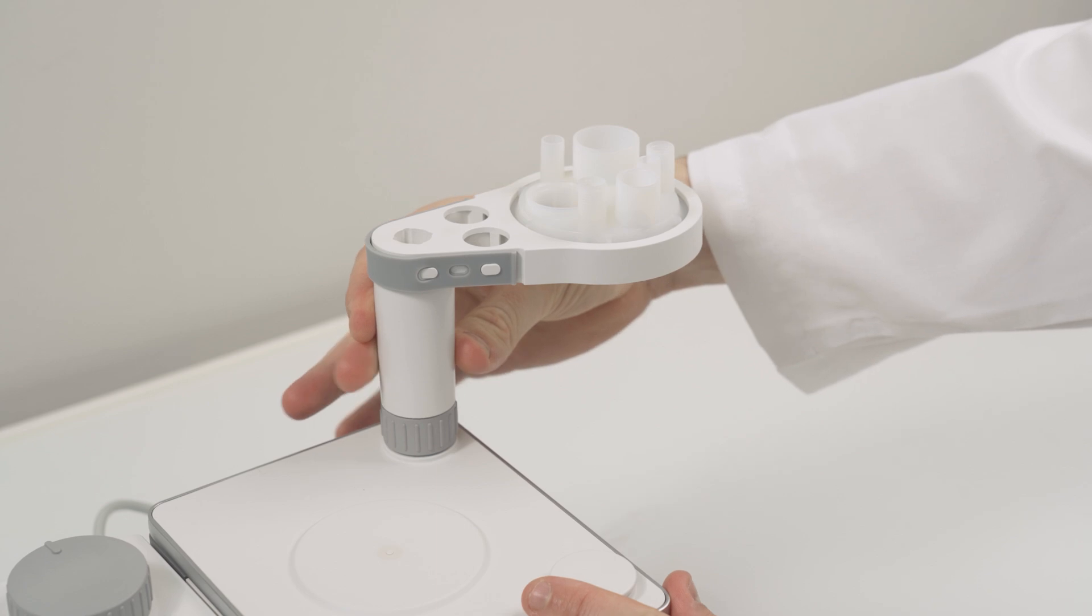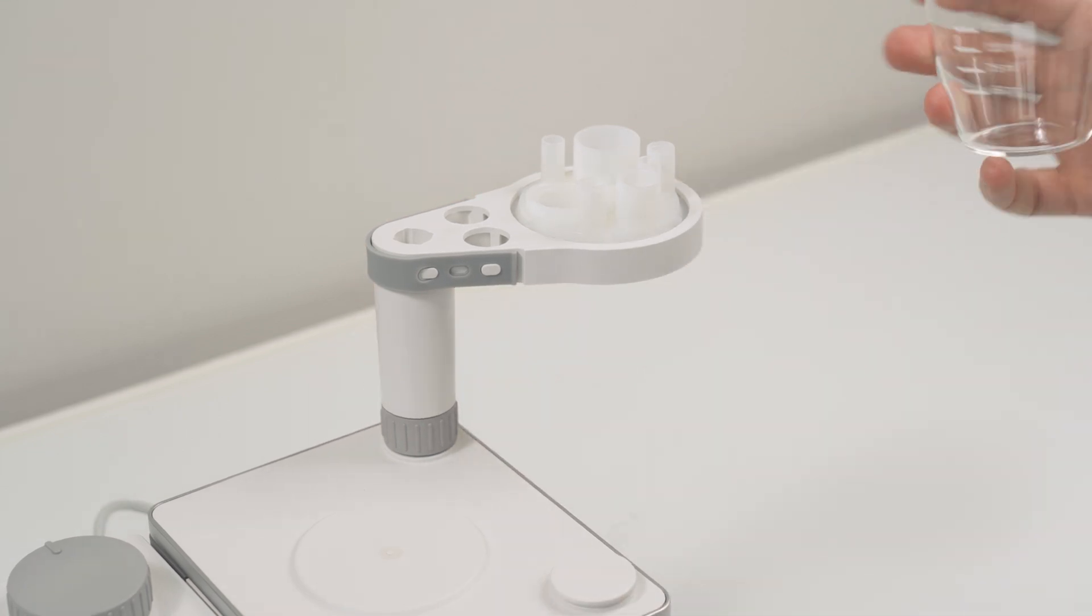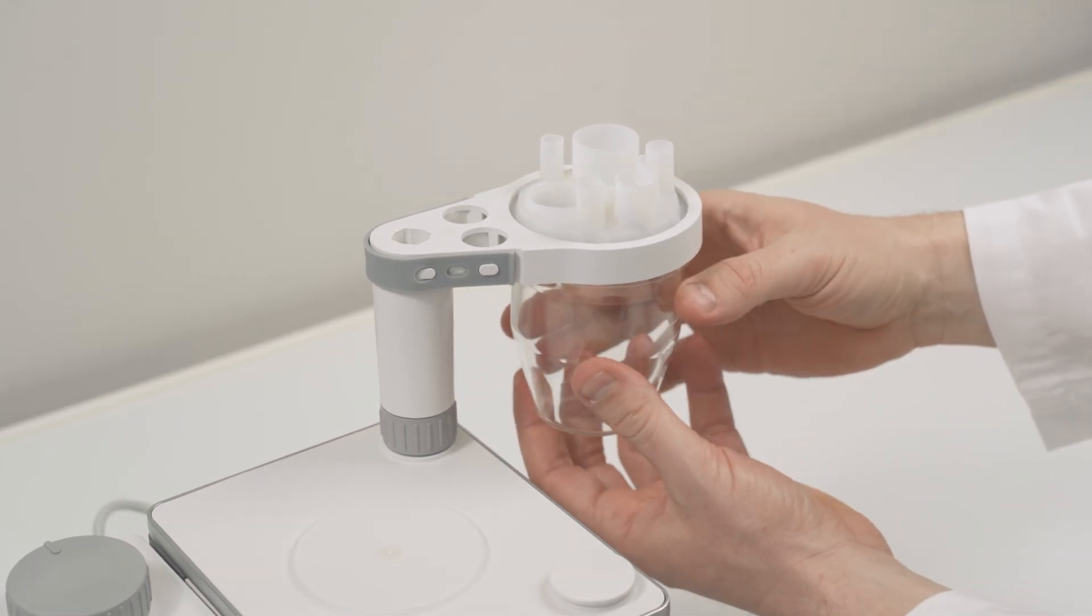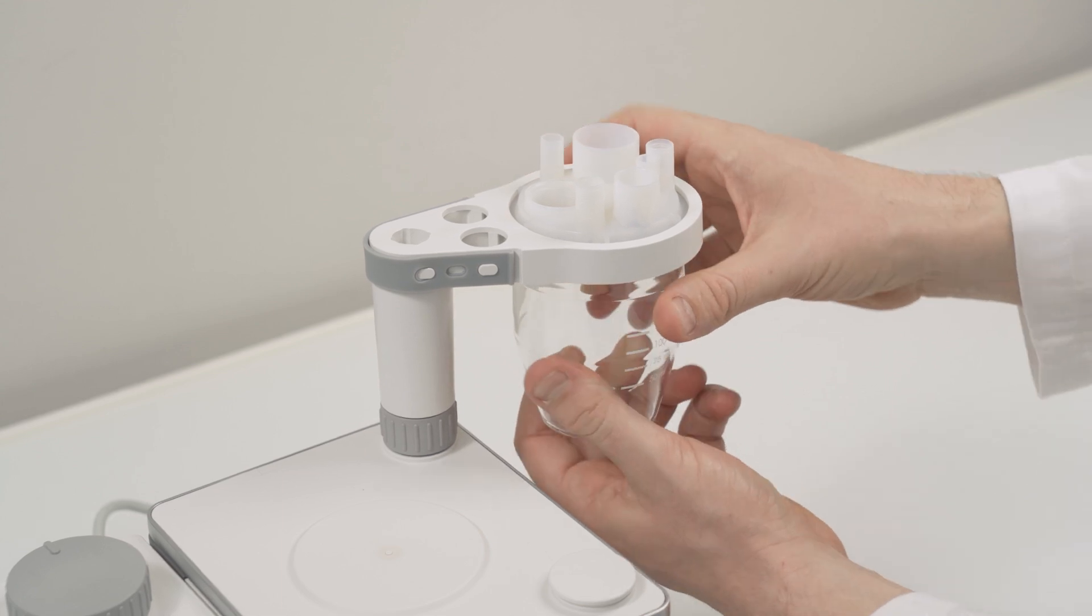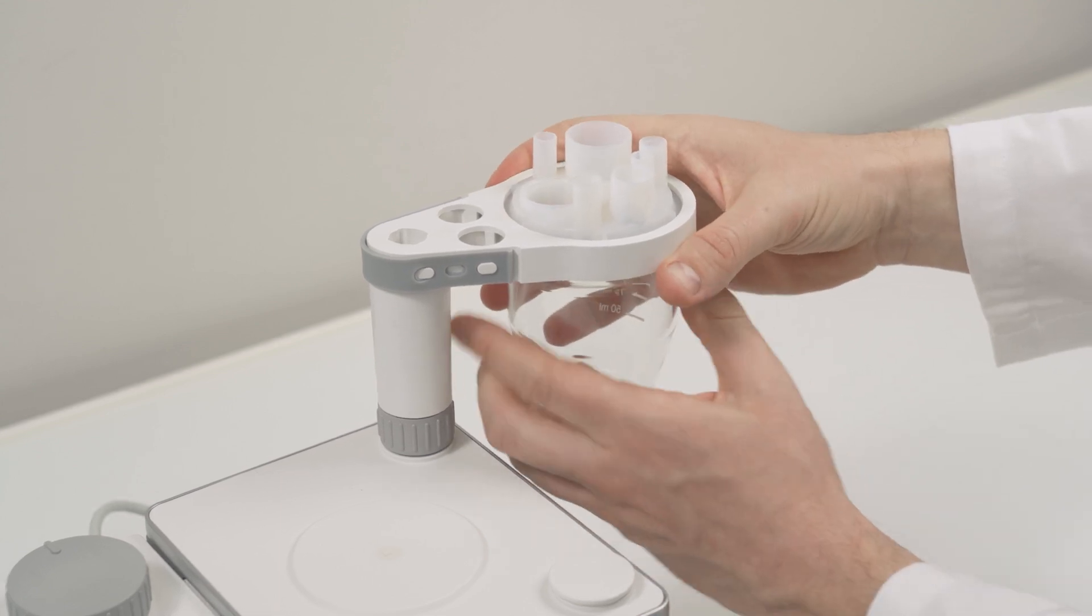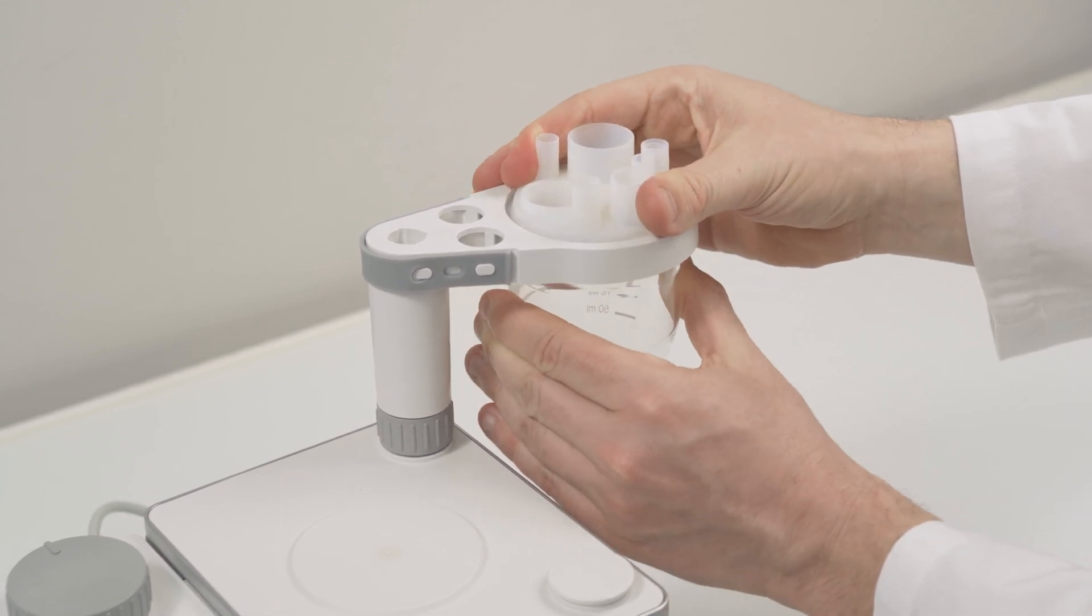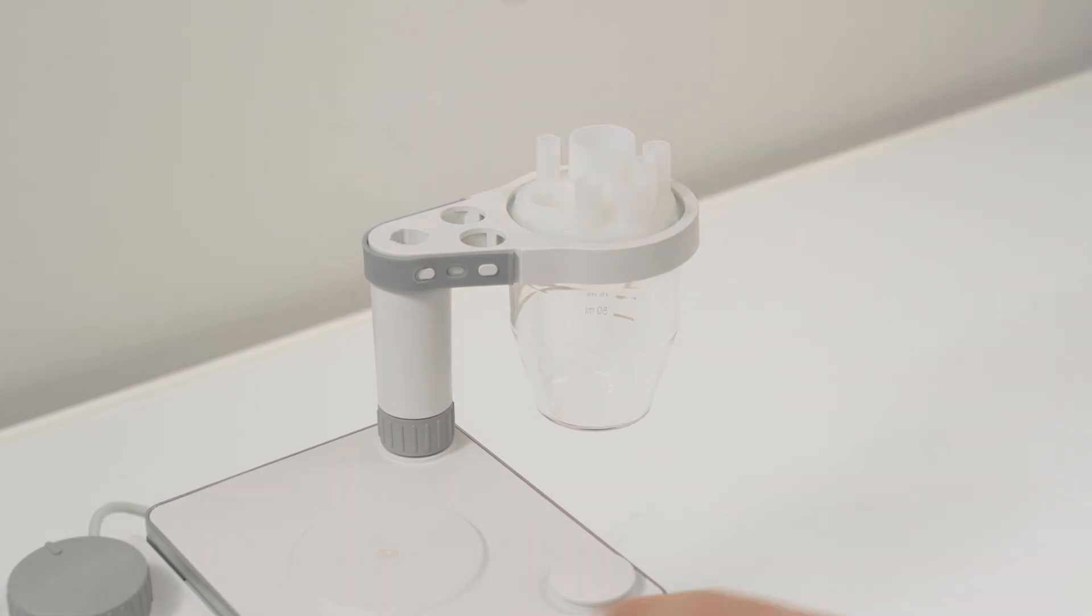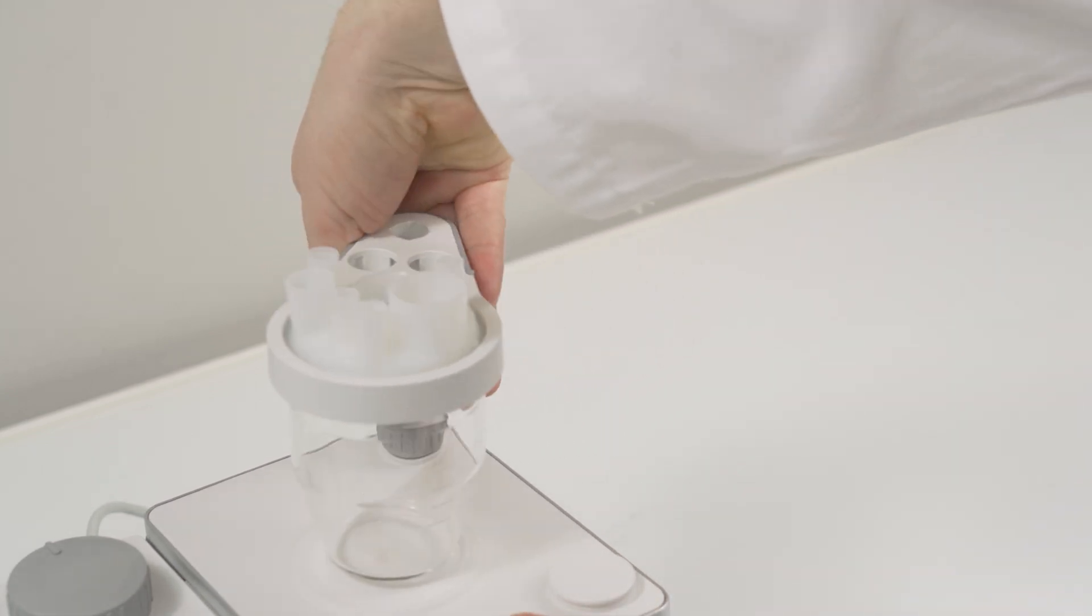Swivel the arm out and attach the glass vessel by holding the adapter plate with one hand and turning the vessel anti-clockwise. For the actual measurement afterwards it's important that the whole titration cell is sealed against humidity. So make sure that the vessel is properly fastened and the sealing is tight.